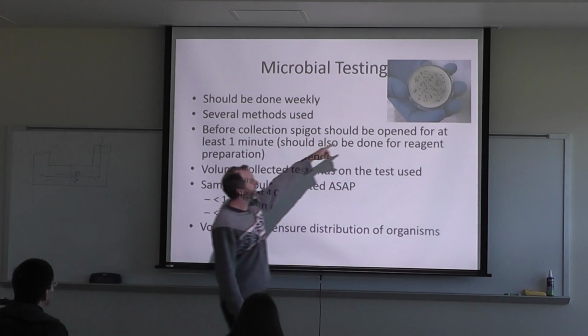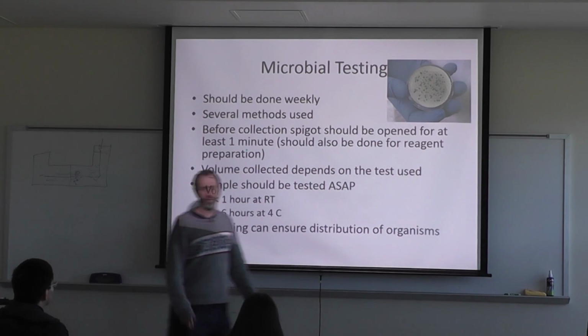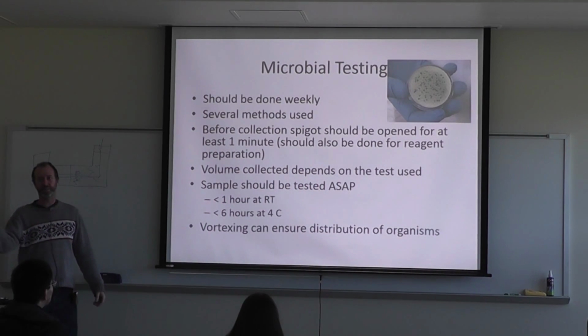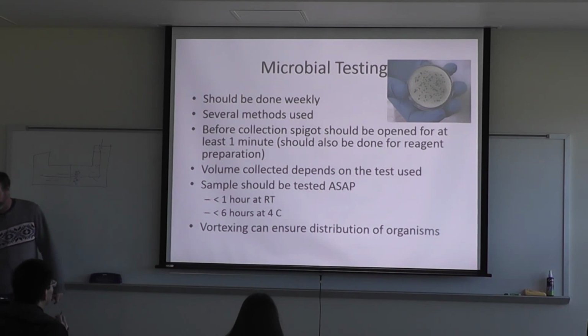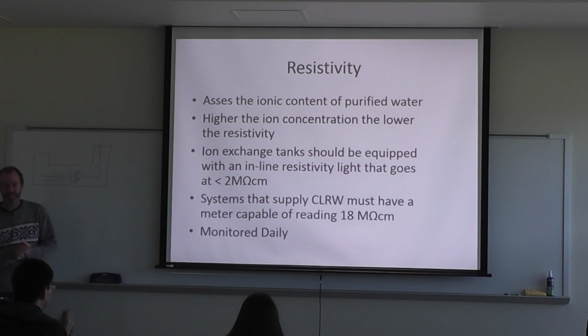This is actually a contact plate that you can set out and touch to things to see what bacteria is contaminating different surfaces. So. Resistivity.